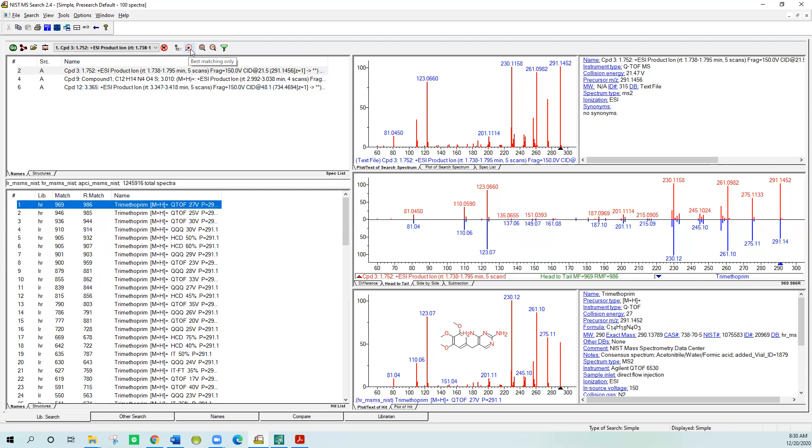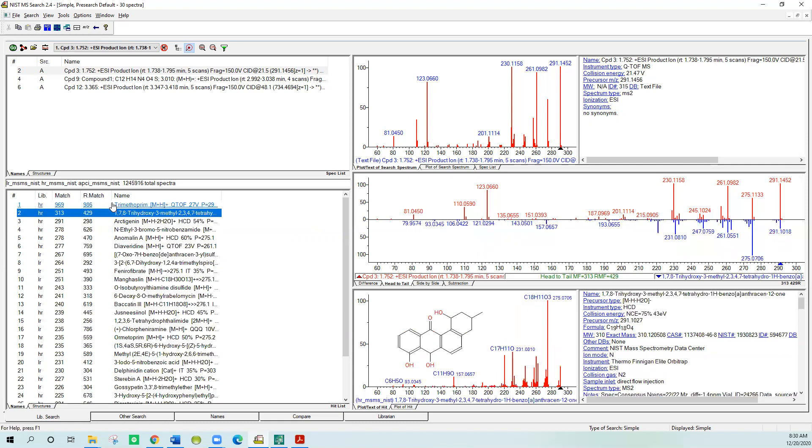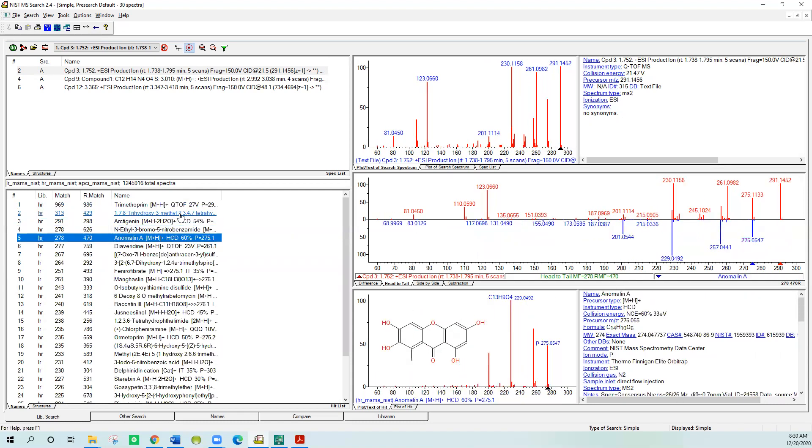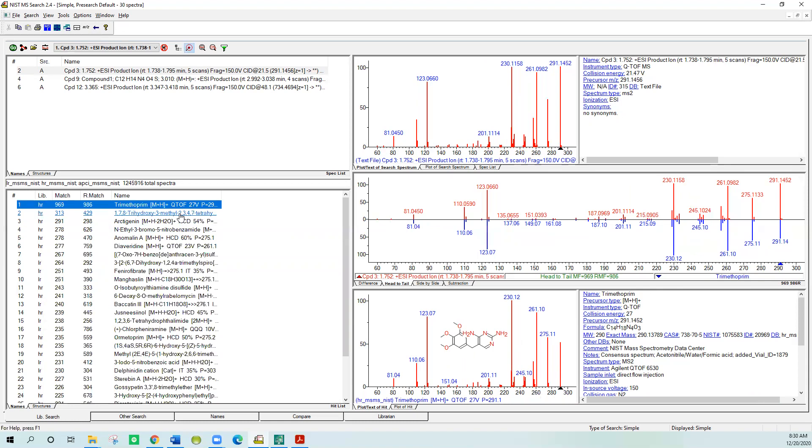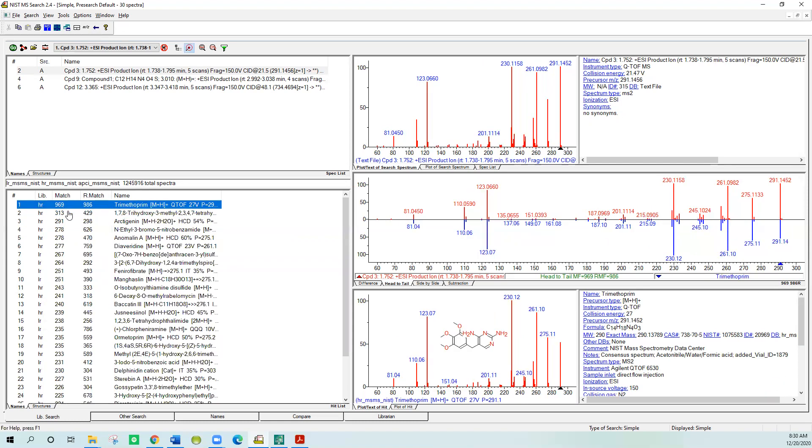I really want to know if there's anything else besides trimethoprim in here that I'm interested in. Well, if I go up to this best matching only, this little thing looks like an arrow through a target, and click on it, it'll get rid of everything with the same CAS number. So when I do that, now my first hit still looks good: 969. You can see the unknown's on the top, the known's on the bottom, and then you have the mirror image so you can compare. But you can select the first one over in the hit list over here and then I can use the arrow keys to quickly step through them.